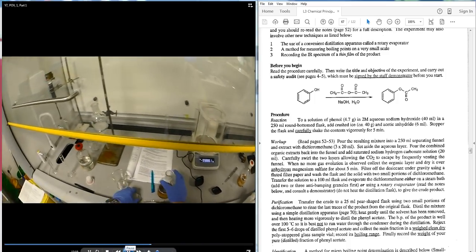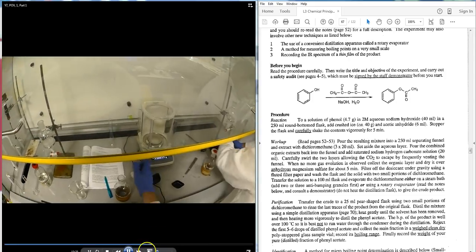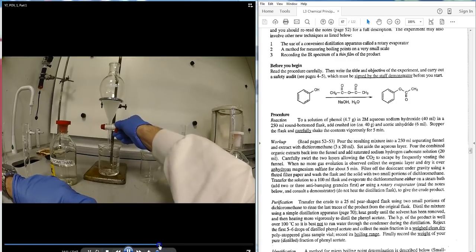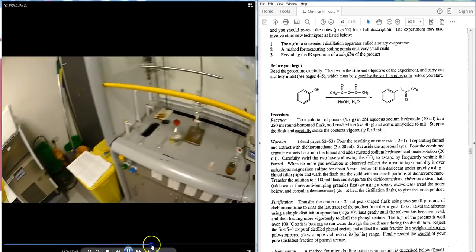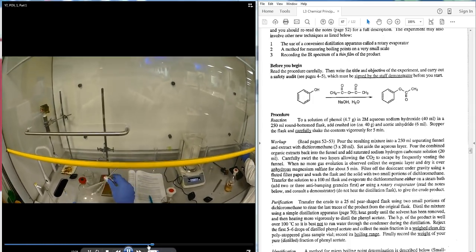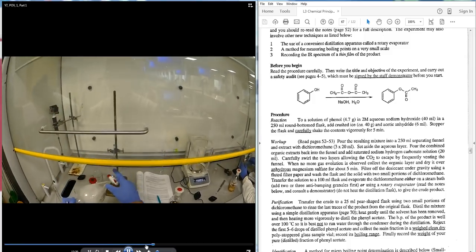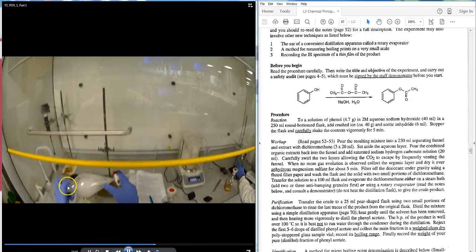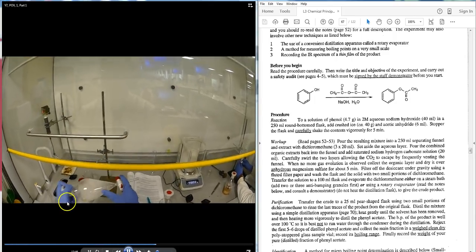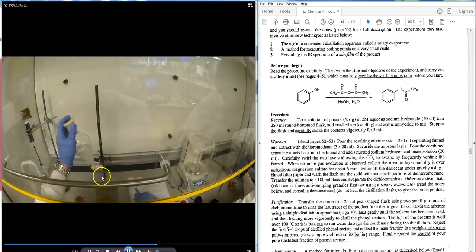As in the previous lab for this module, the stopper goes on and the student inverts the funnel with a beaker underneath. The student swirls and vents the flask away from their face and other workers, keeping a hand over the stopper so it doesn't pull out and spill the contents. This is done correctly.